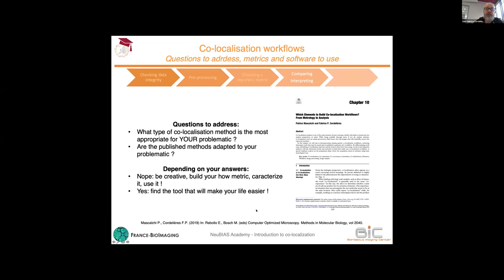About the tools, we've been writing a review with Patrice Mascalchi. At the end of this review, you will find a table with a list of a lot of the tools that exist, what kind of co-localization they allow you to do, and where to find them.